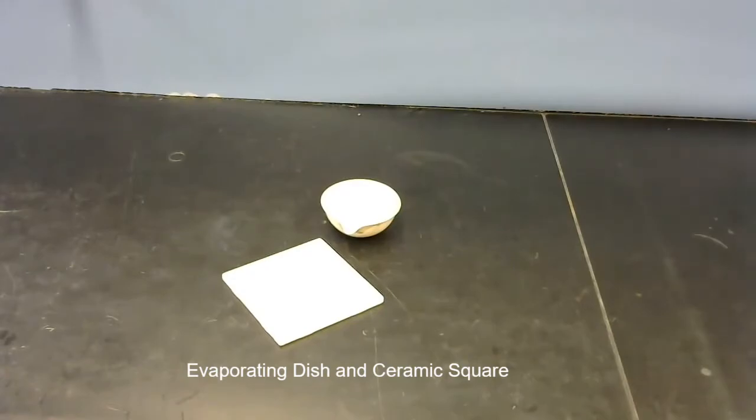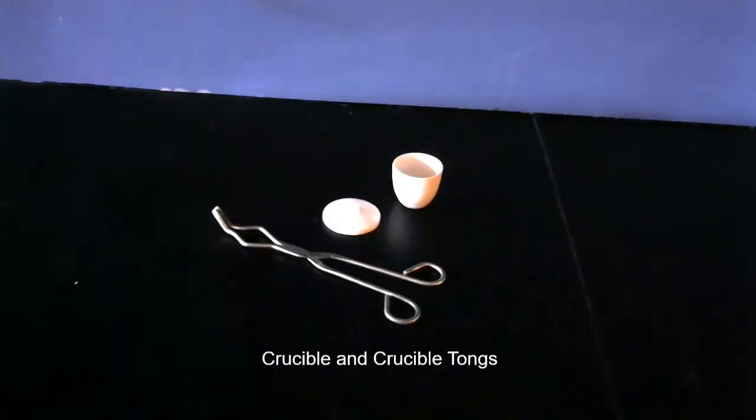What you have pictured there is a crucible with lid and tongs. You'd use the tongs to manage the lid and to lift the crucible on and off heat. You'd put what you want heated in the crucible for different labs and cover with the lid.